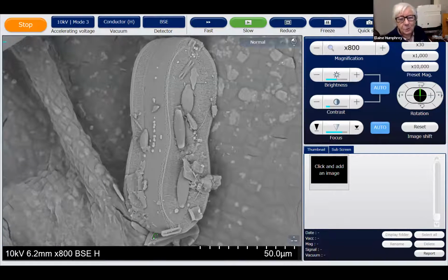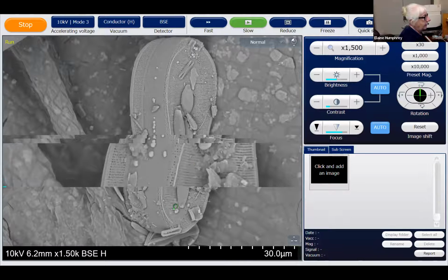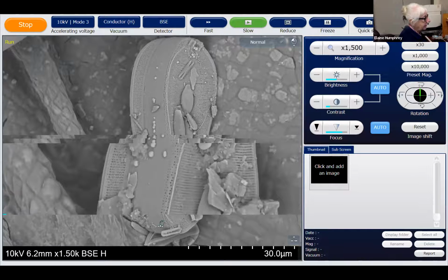But ones that do produce mucilage tend to be very sticky. Well, you can imagine, right? And this background is the eelgrass. These are the cells of the eelgrass. But here, you can see how sticky it's got. These guys here are called Amphora. And this one, I think, is a navicula. Maybe another Amphora. But you can see the whole pattern on this is quite different from the other ones that we've seen.